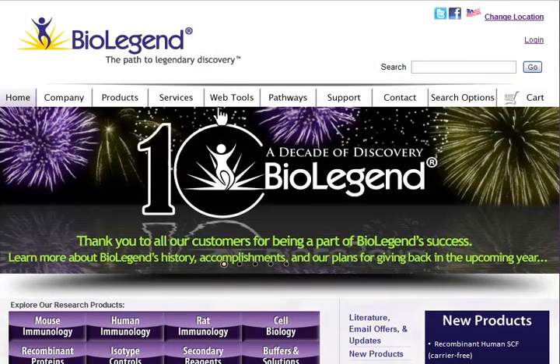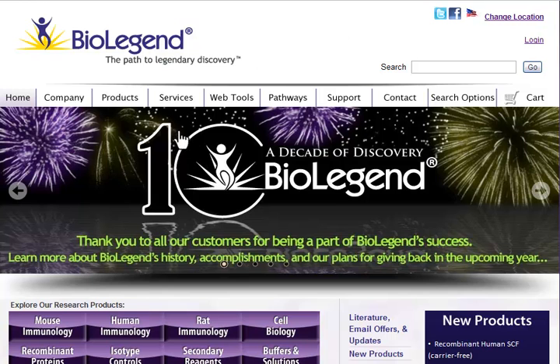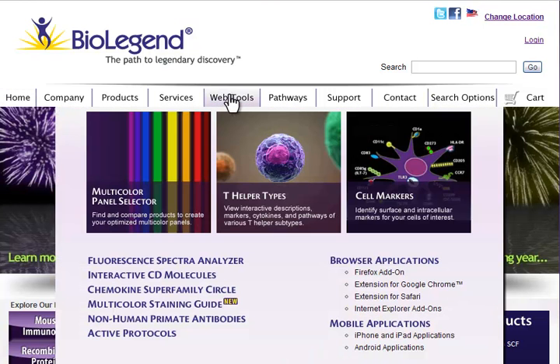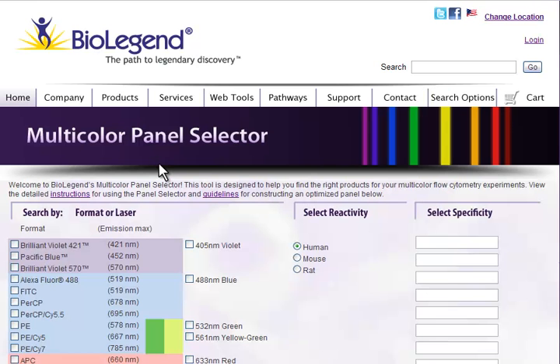From any page on BioLegend's website, you can mouse over the Web Tools tab. From here, select the icon for the multicolor panel selector.